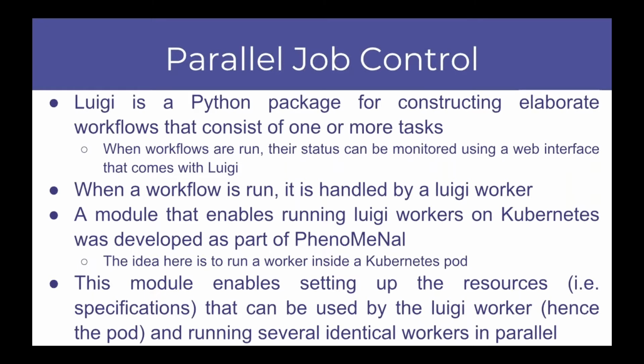When a workflow is run, it's handled by a Luigi worker, and this Luigi worker is going to run inside a Kubernetes pod. Our colleagues in Uppsala, Sweden, developed a Python module that's an interface between Kubernetes and Luigi.